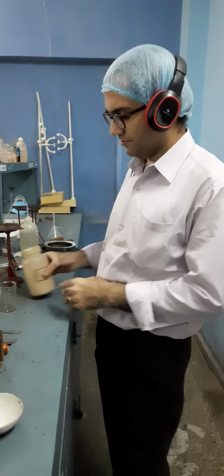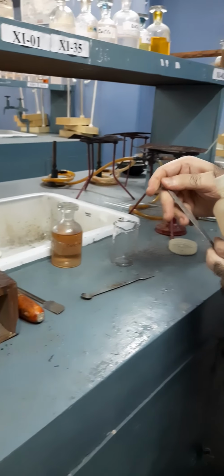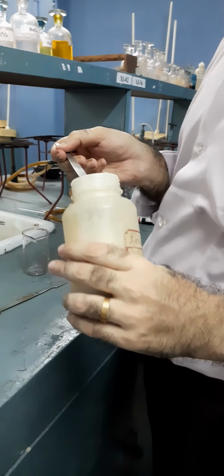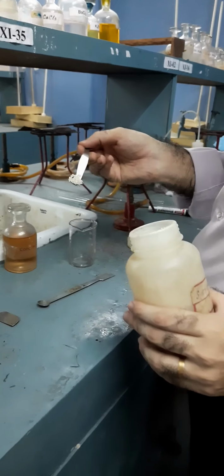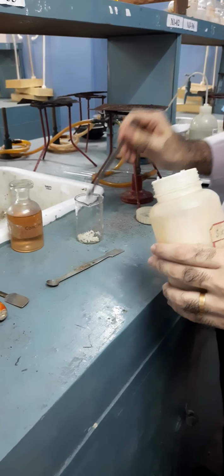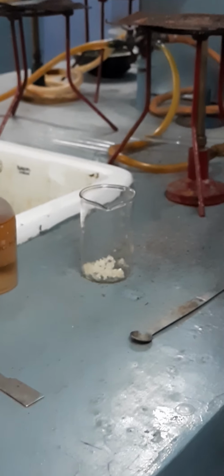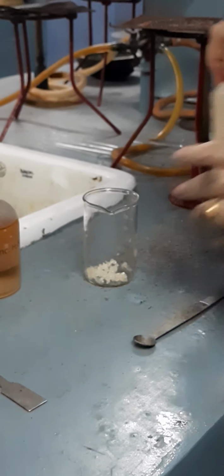Let's check it out. We are taking sugar over here. As we know, the spatula is over here, and we are taking that sugar. We can see sugar crystals. Alright. So I'm taking this sugar inside a beaker, and with this sugar I'm going to add concentrated sulfuric acid.